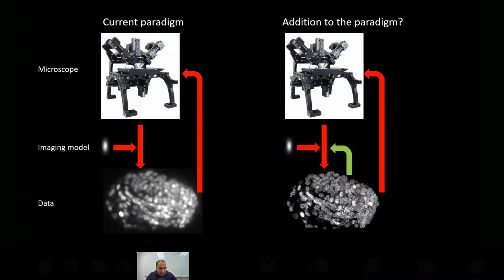I think the great strength of these data-driven deep learning algorithms is that you get one more hook back into the data. The data itself can improve the data. And so you can take data without sacrificing inherent strengths of the underlying microscope. I mean, to me, that's the main advantage of these methods.